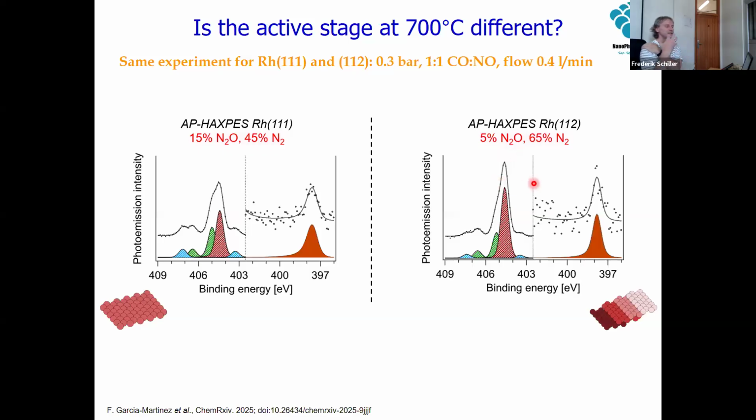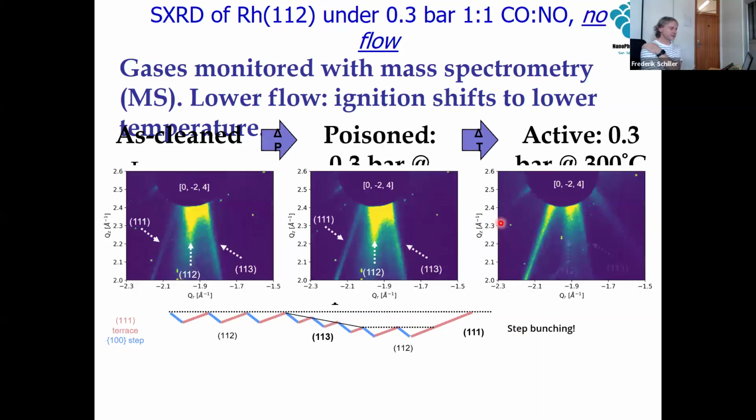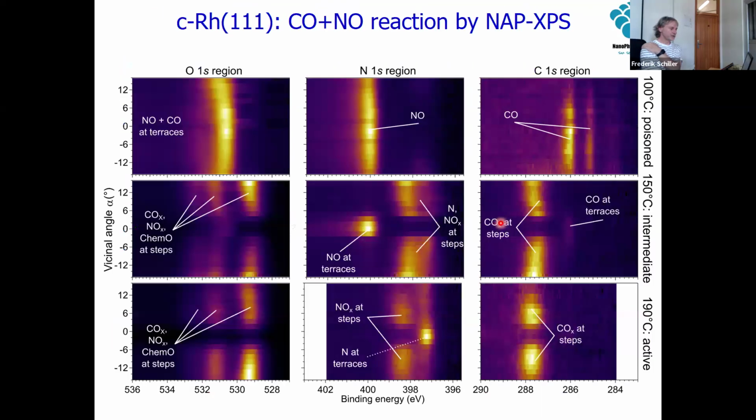So this is, let's say, the design of our catalyst. We now know that using such a crystal, such a phase, is much better than using such a phase if we want to have a large turnover of the atomic nitrogen and a small amount of N2O. So this surface is much better selective to the process we actually want to have. This I will skip.